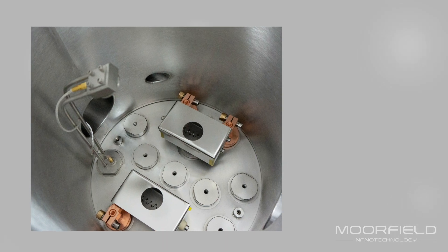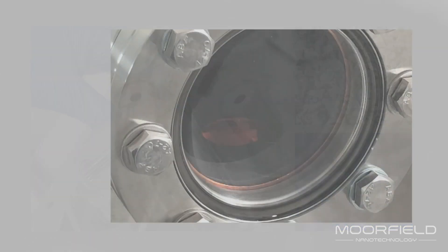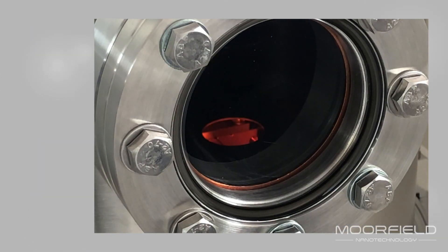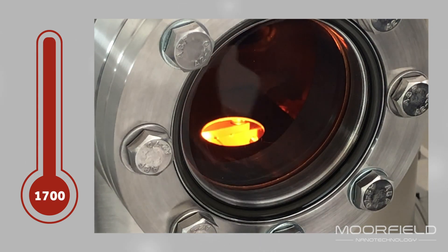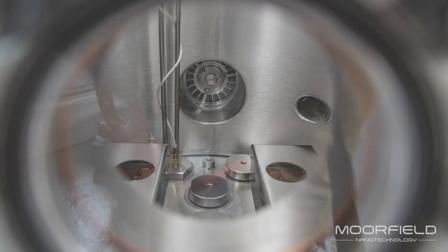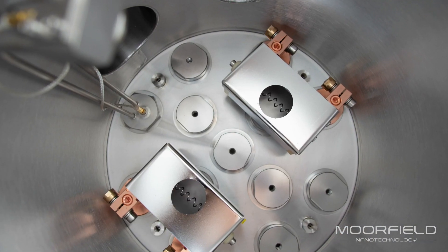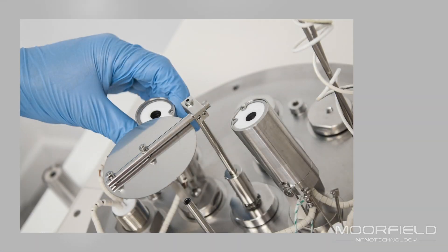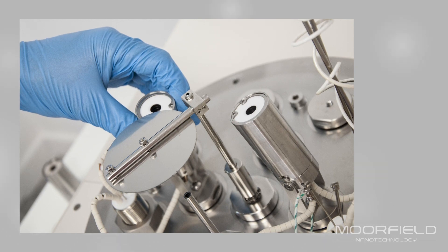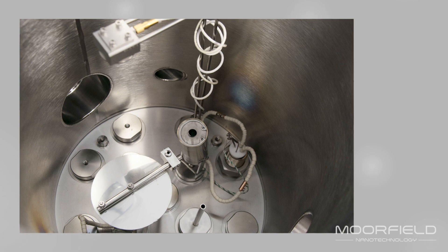The unit can be fitted with sources for deposition of metals and organics. For metals, sources are fitted with resistive elements that allow for heating up to 1700 degrees Celsius. Metals sources are fitted with box shielding for efficient operation and restriction of stray deposition material and infrared radiation.